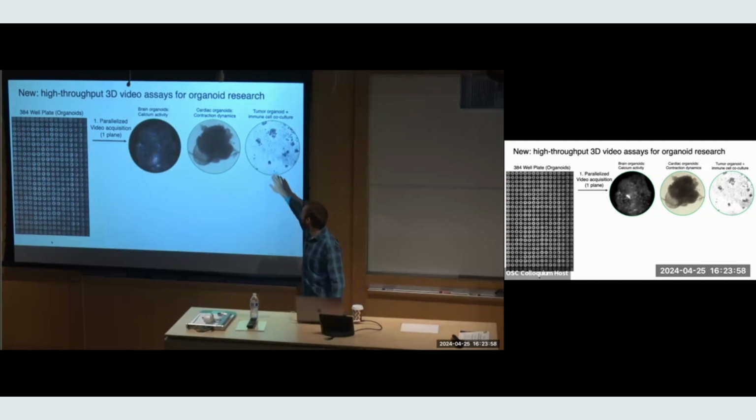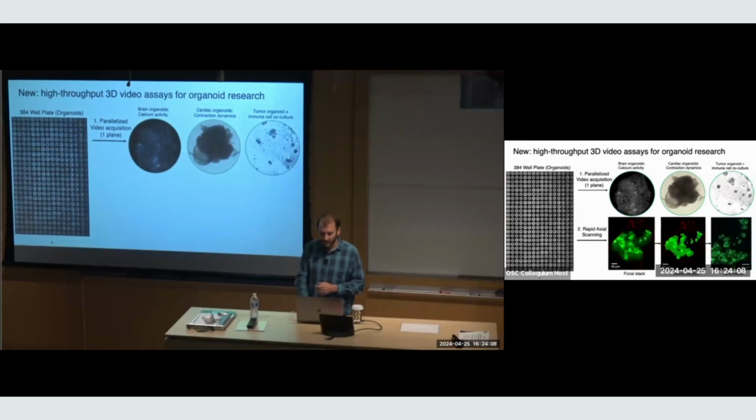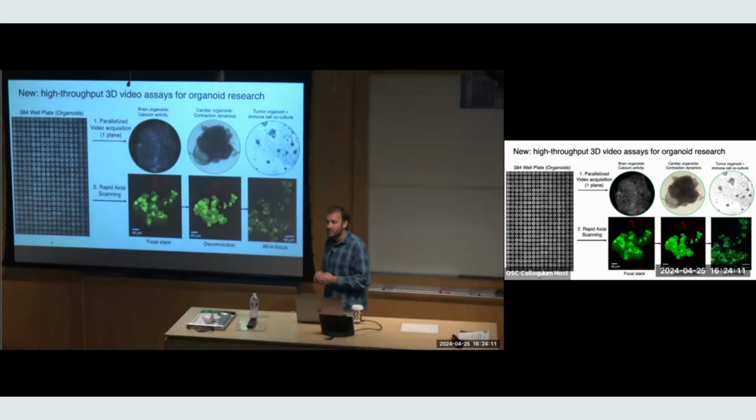And then here, this is a time-lapse image of tumor organoids. So you can begin to study the impact of drugs, treating them, seeing how white blood cells go after tumors and things like that. Okay, and so in this platform, we also do 3D imaging.